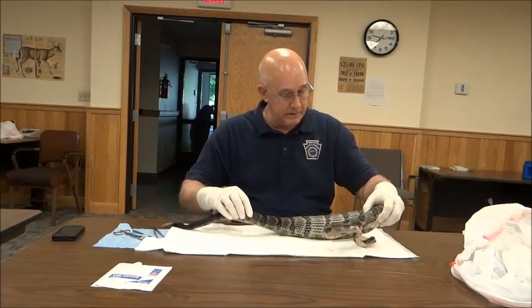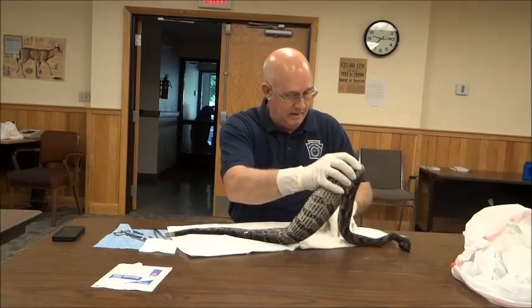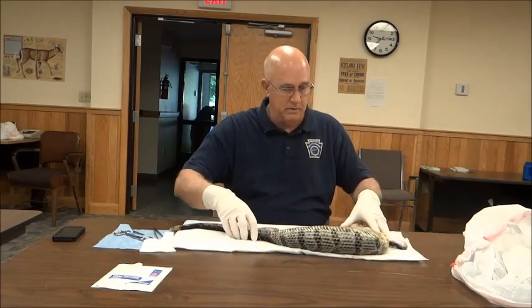Twenty-two subcaudals, so it's a male. I think probably the easiest way is just to use a piece of scissors.